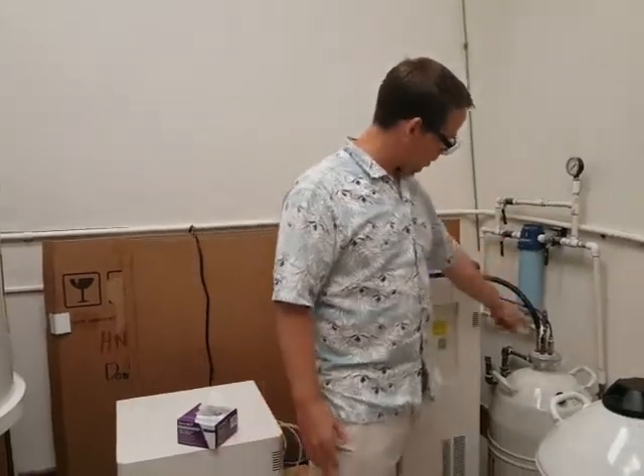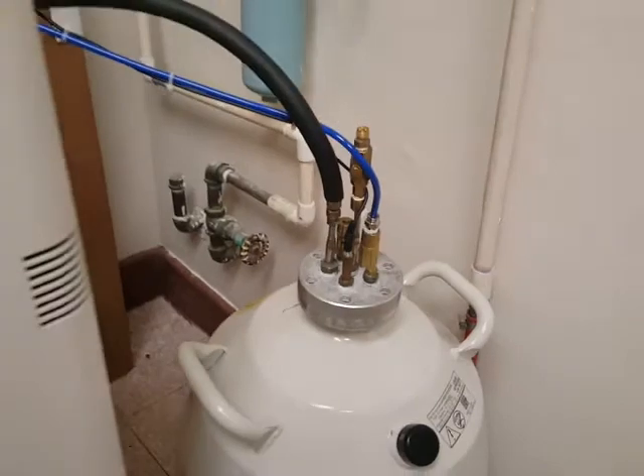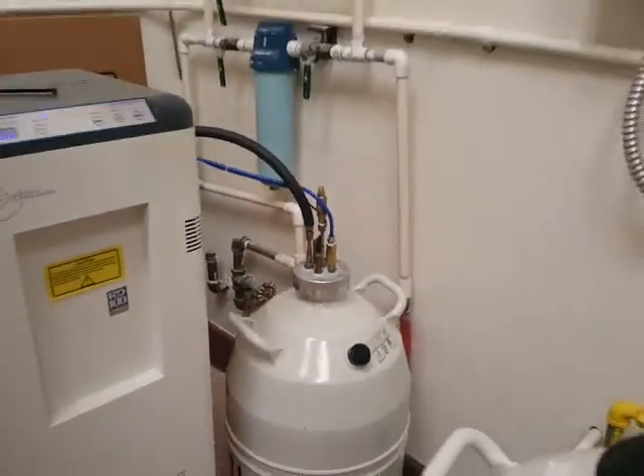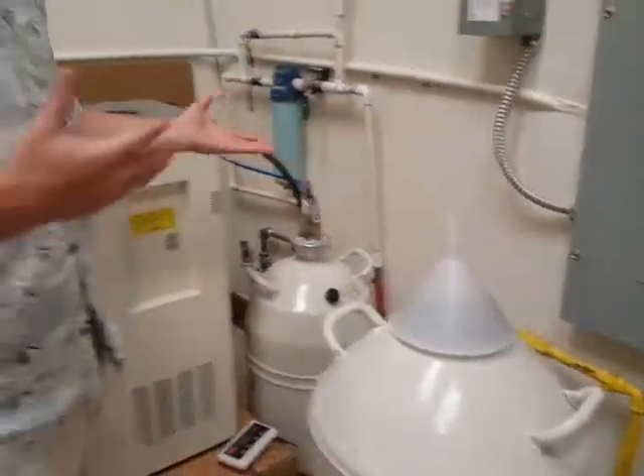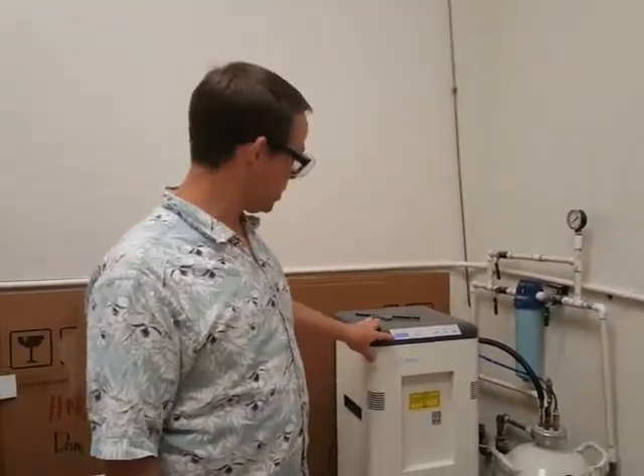Liquid nitrogen is going to pump into this little thing here. Right now, these screws are not on and they probably won't be for the foreseeable future because that's not part of the apparatus that we need to have working. If you want to take liquid nitrogen out, right now it's not pumping because it's full.